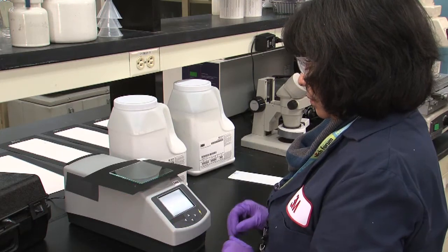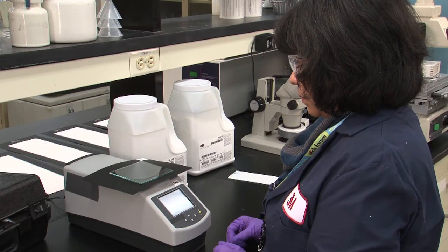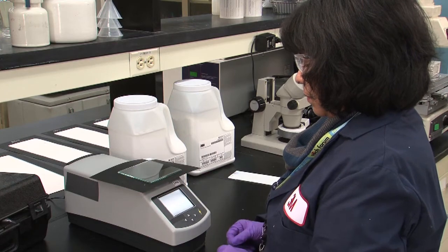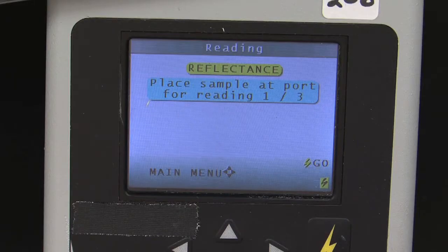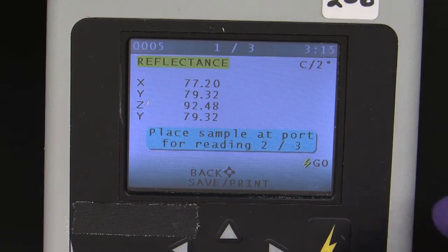Before running the washability test, we marked and measured the reflectance of several points along the drawdown panel. Now, after the panel has been soiled, washed, and dried, we re-measure those same points to see how the paint has been affected.